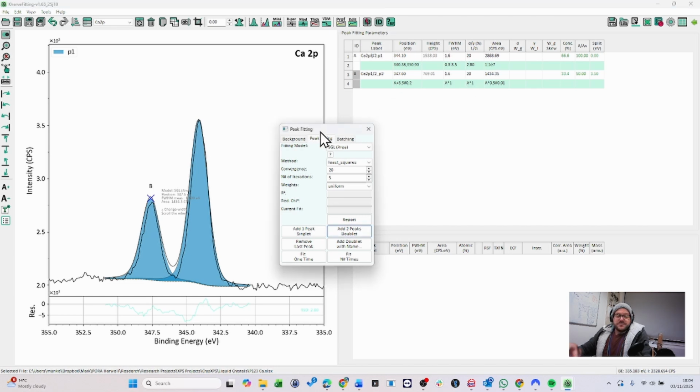There should obviously be a little bit of caution with some of these. If you have something like chemical broadening, you're going to have to modify your full width at half maximum parameter locking. But at that point, you're probably going to be a bit more aware of what you're doing anyway, so you should be picking up on these kind of things. We've got the same options as before.